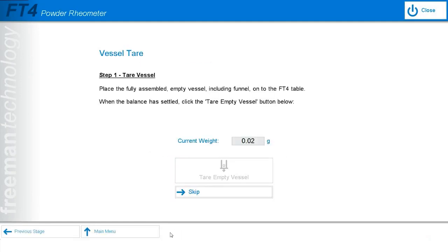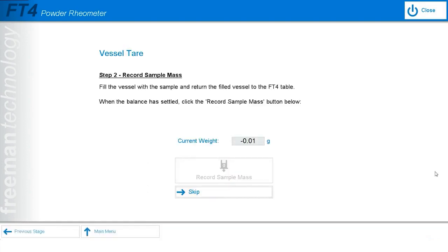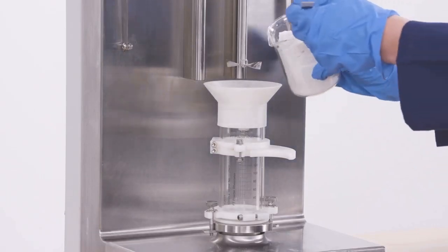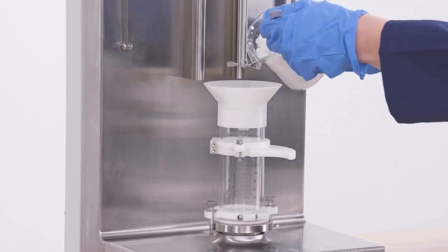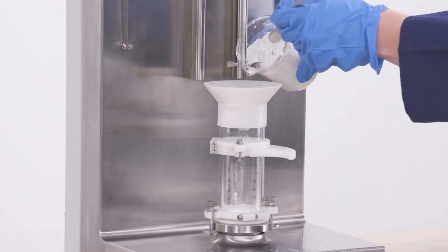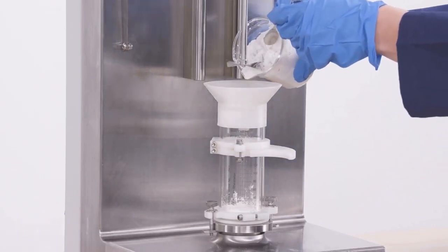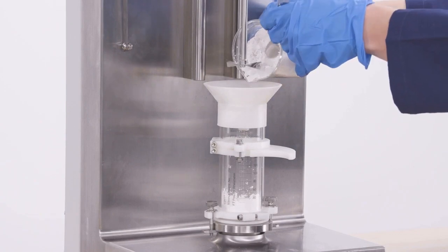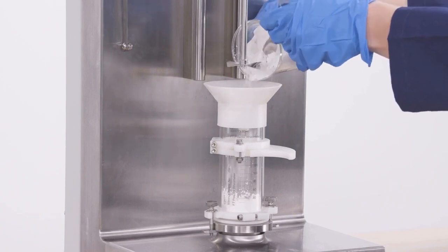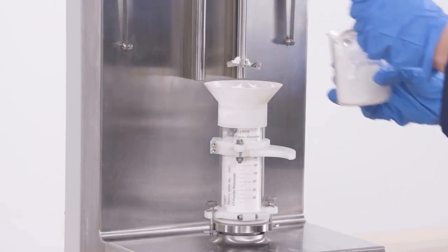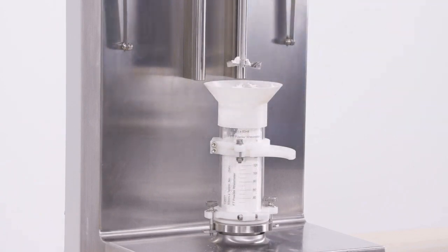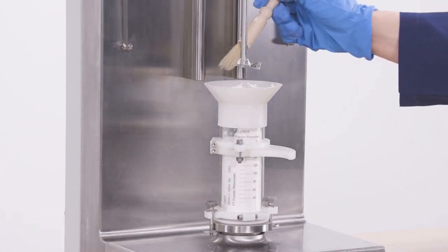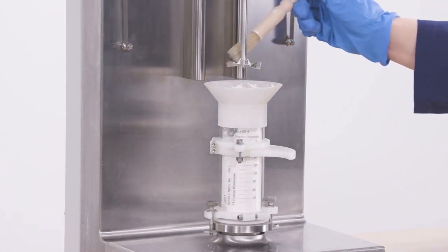At this point, the software is going to tare the empty vessel, so I will wait for the mass recording to stabilize and then click tare. Here I have some example material I will load into the vessel. You need to add enough powder so that it goes above the split level in the vessel. I'll quickly brush off any excess material that got stuck onto the funnel.